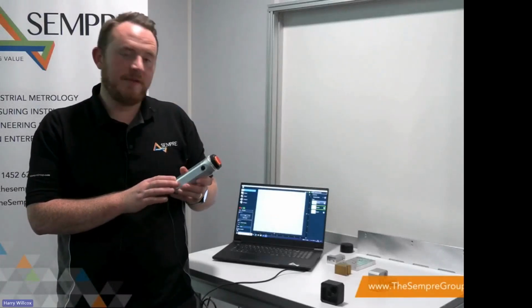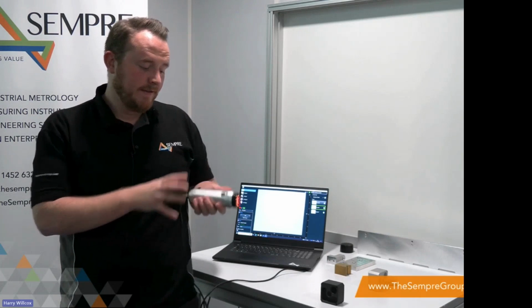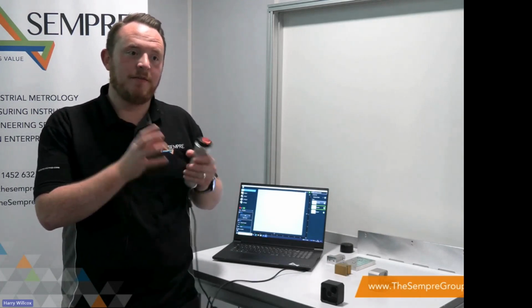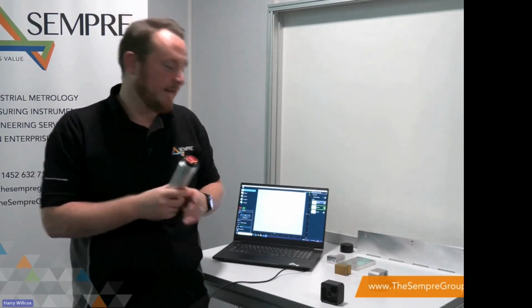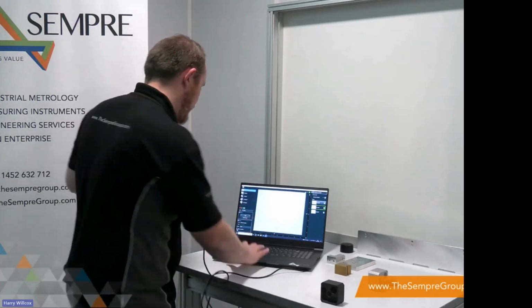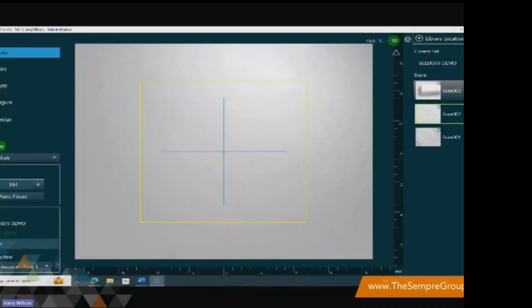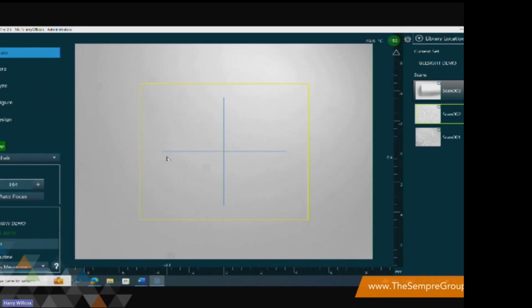Using the Gelsight Mobile Series 2, we're able to capture profile roughness and surface roughness. So the capability of this equipment is to measure between 2 and 20 Ra, but using the Gelsight Max system, we can characterize between 0.2 and 20 Ra. So just something to note. So in the bottom left-hand side of the software, I can go to Run Routine, and I'm going to select my 10 micron Sa measurement.